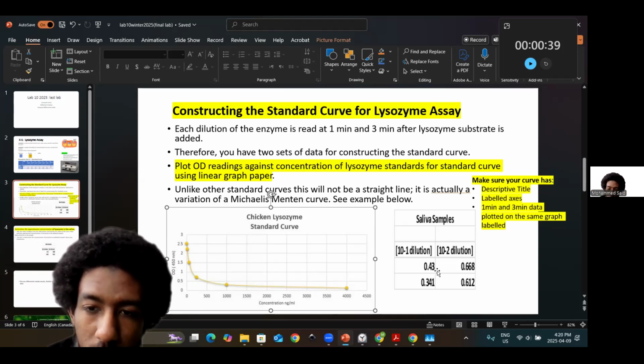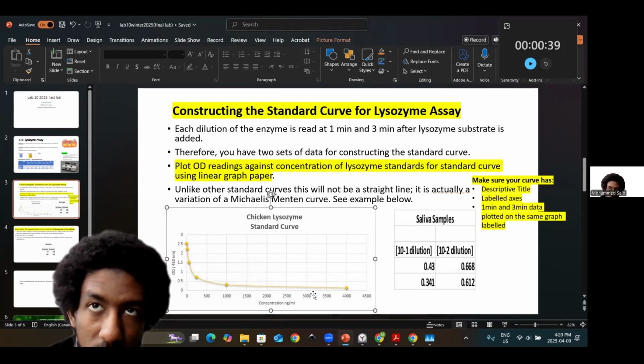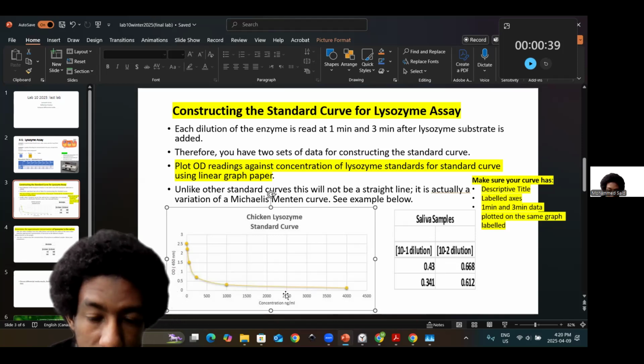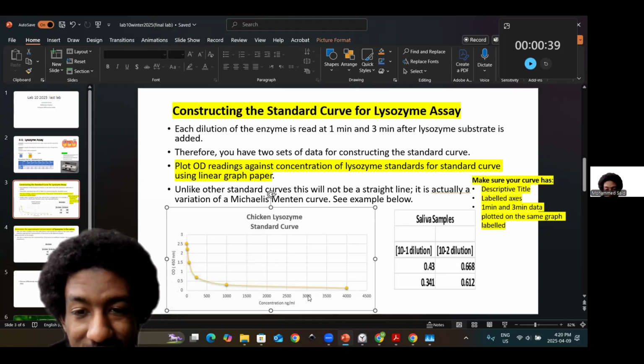And so you would repeat the same process once you've made your curve. Make it smooth in this case, nonlinear. Remember that if it's generation time semi-log or TDT semi-log, it's a line of best fit, and then you would plot accordingly. After that, you interpolate, go down, reach the x-axis, find out the concentration, and account for the dilution factor by dividing by the negative exponent. When you divide by a negative exponent, you get the true value that's higher, either 10 times more here or 100 times more than the concentration that you find from the interpolated points on the x-axis.